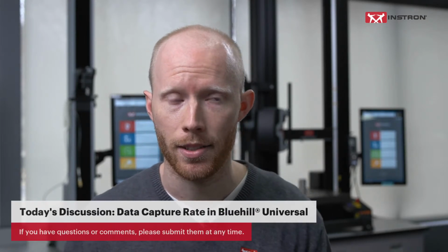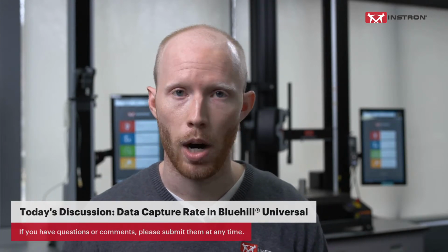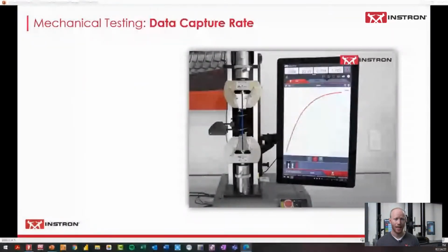Data capture rate is one of the most important parameters to be very familiar with and be very aware of how you've set that up in your test, to make sure we have the proper amount of data captured and that our calculations are exactly as we expect them to be. So we're going to switch over to a couple slides just to introduce the idea of data capture rate, to make sure we're all on the same page before I dive a little bit into our software application, Bluehill Universal.